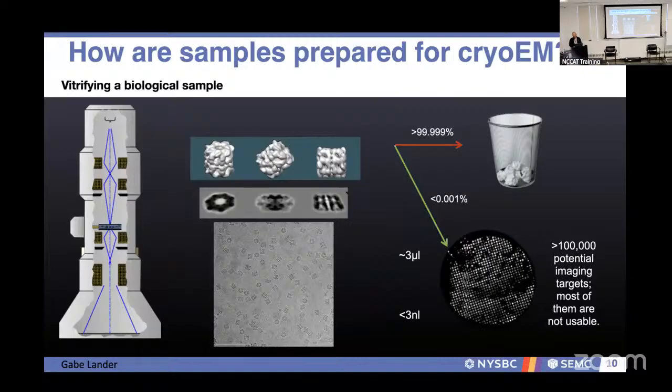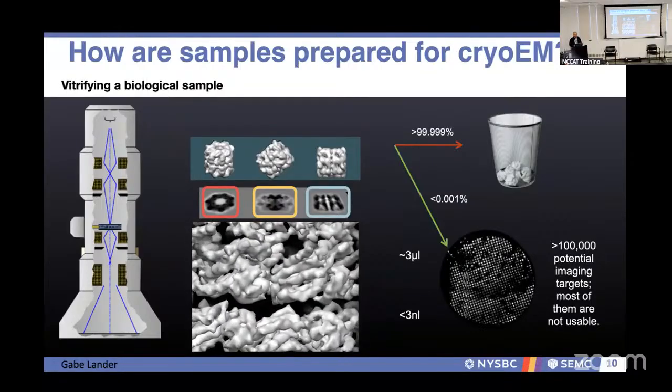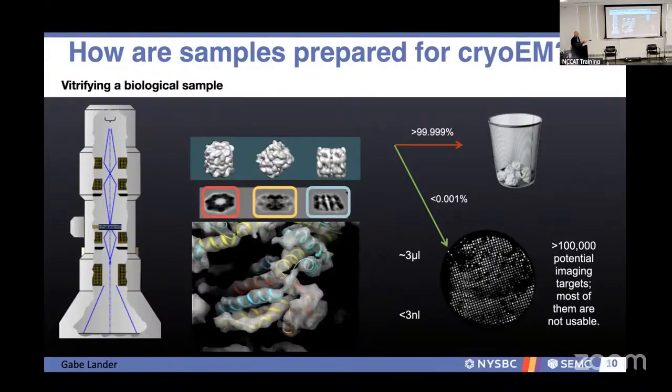And as I said, we're not very precise in terms of cryo-EM on our terms, because single particle analysis doesn't mean a single particle. We're averaging multiple particles together, but we're looking at a single target in the whole process. But this is where the enrichment and homogeneity and a lot of the algorithms come in, in the sense that if we're able to be a good steward of our sample, make sure it's in a biocompatible conformation and we carry it all through the process, then we would be able to start reaching answers to the biological questions we're posing.